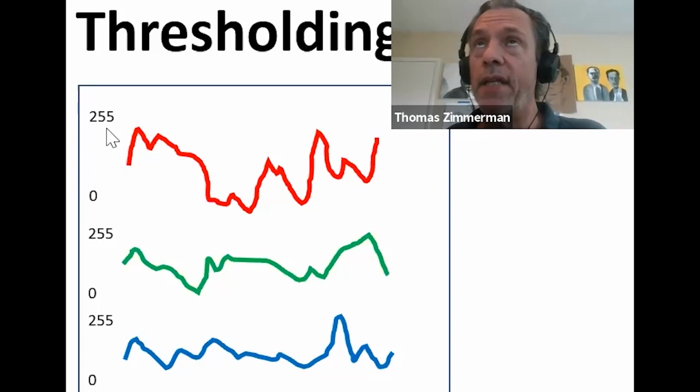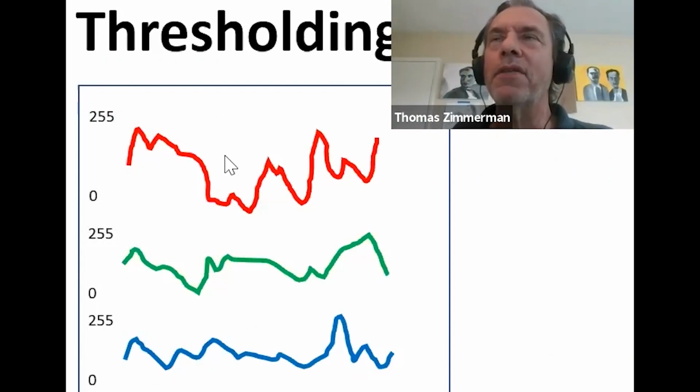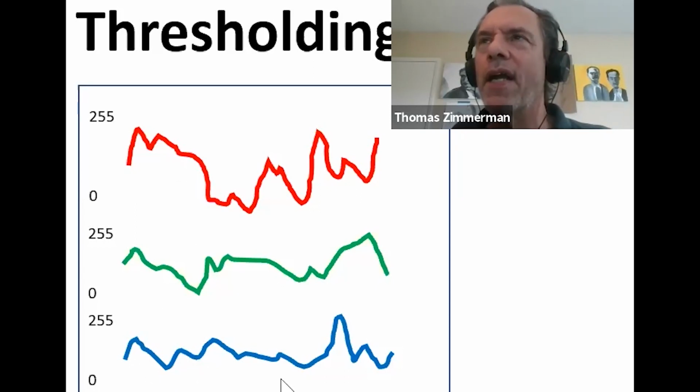And we're going to look at the values of each channel, the RGBs. The higher it is, the more red. And usually they're in sync. So these are the 3 values for the red, green, and blue channels. And X is the horizontal, the pixels.